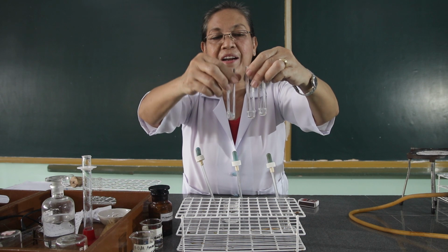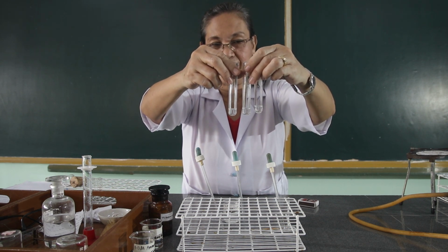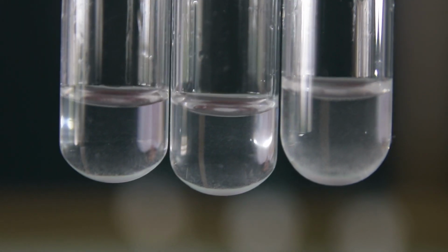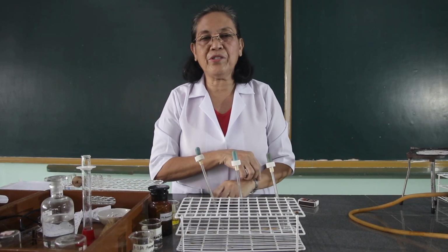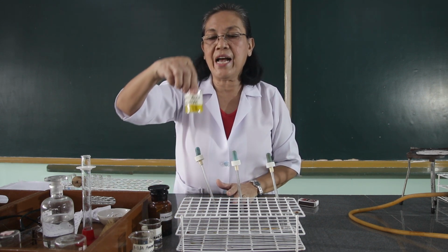Kindly compare keenly the three test tubes or vials. Then for the next procedure, we're going to analyze again by precipitation test these three ions, but this time we're going to add the picric acid solution.